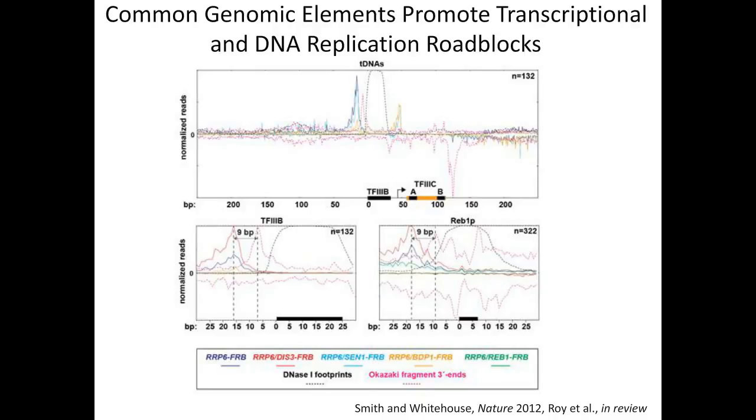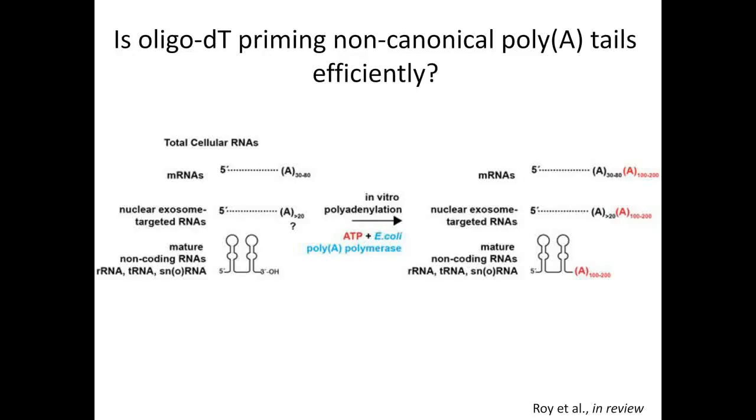That's a great question. So I skipped over that detail. The first time that we did it, we got nearly 80% of the reads mapping to the 3' end of ribosomal RNA, and that's really a waste of a lot of sequencing reads. So the second time, we used a ribosomal RNA depletion kit after the in vitro polyadenylation. These kits typically don't give you much yield, so we first performed in vitro polyadenylation with a substantial amount of RNA, let's say 10 micrograms or 20 micrograms, and then re-quantitated the RNA and subjected it to ribosomal RNA depletion.